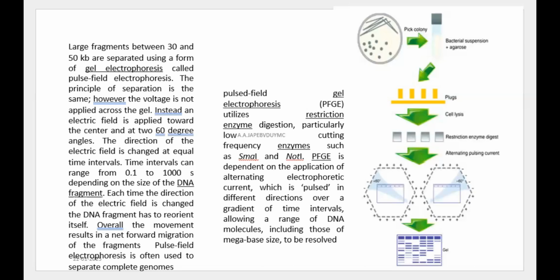Now when we talk about pulse field gel electrophoresis, a further development of the basic technique, you can separate DNA of sizes say 2 into 10 raised to 3 kilobase pairs, right? So big size molecules can be easily separated. So separation of whole chromosome you can imagine by electrophoretic system when you are using PFGE. In one sentence, you can imagine separation of an entire genome or whole chromosome by an electrophoretic process.